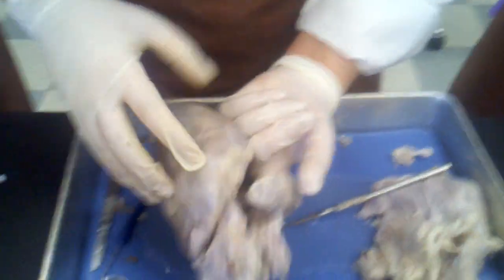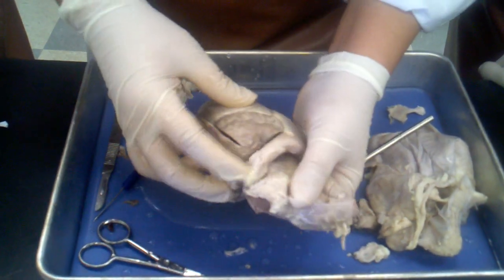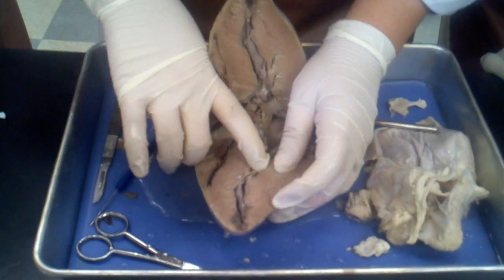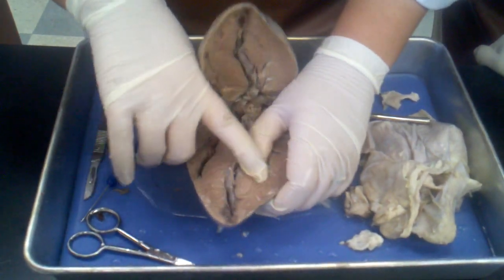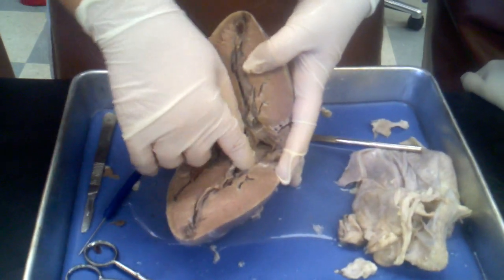Which is then going to go this way — that's the pulmonary trunk — and then it's going to go to the lungs. Come back in through the lungs and go to the left atrium. And here's the bicuspid valve. There's not a lot of room because there's a lot of muscle, because it has to pump the blood through the rest of the body.